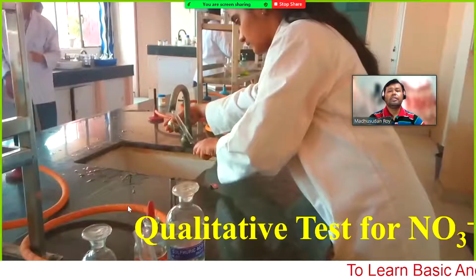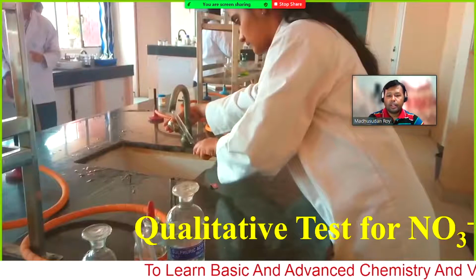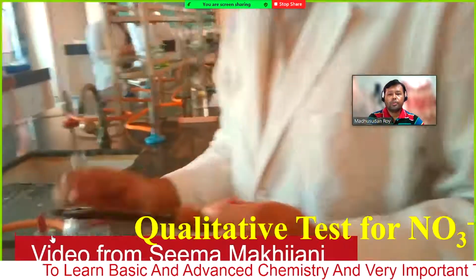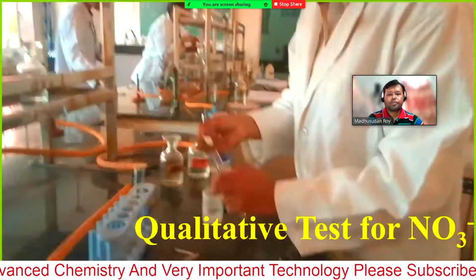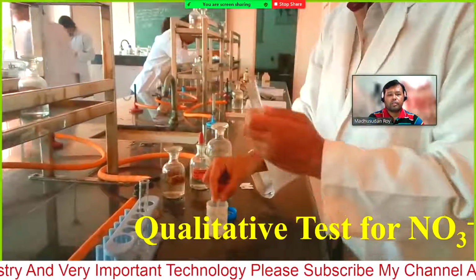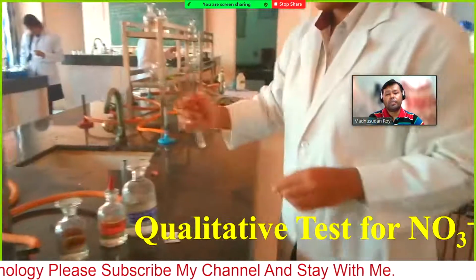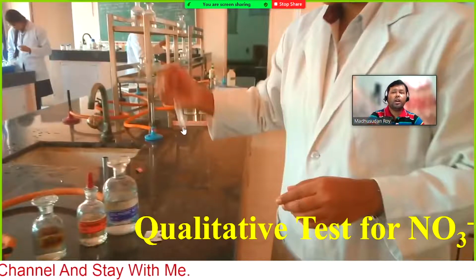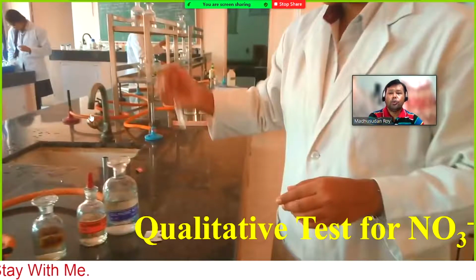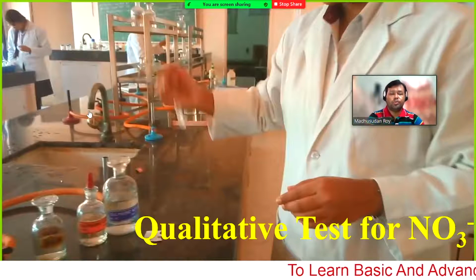Now let's see how the test is performed. And here, first taking the test tube and taking the salt. Okay, salt is taken. Then here they are making some mistake. After addition of salt, they have added tap water instead of distilled water. That is not a good way.